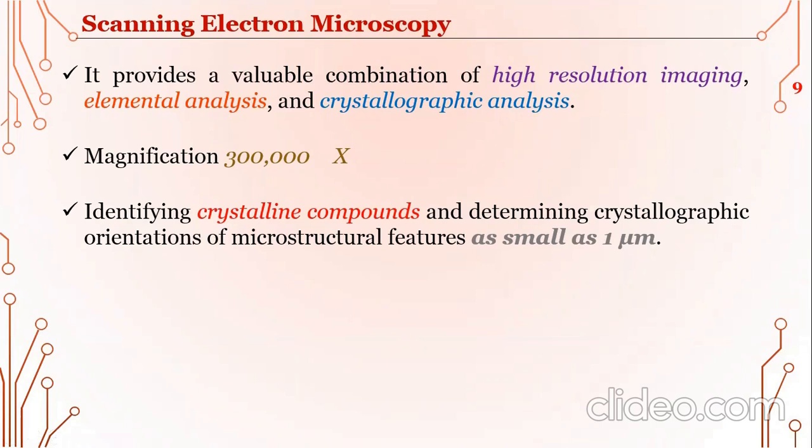To visualize those crystalline structures or compounds, we do need scanning electron microscopy. This is what we use scanning electron microscopy for in day-to-day research.